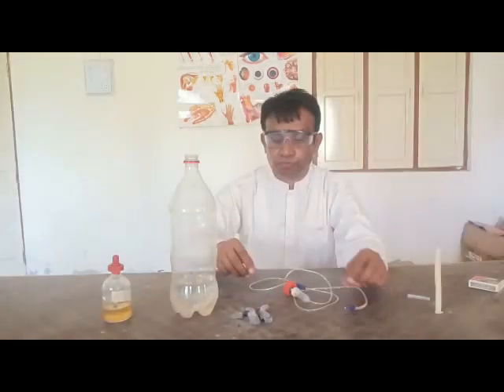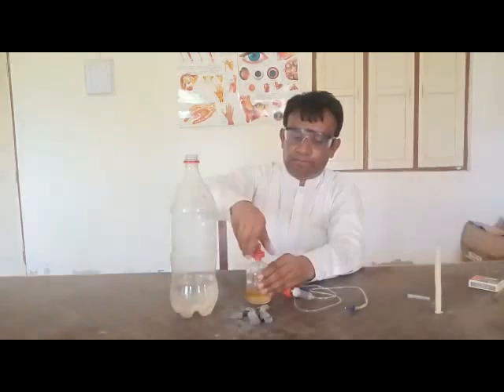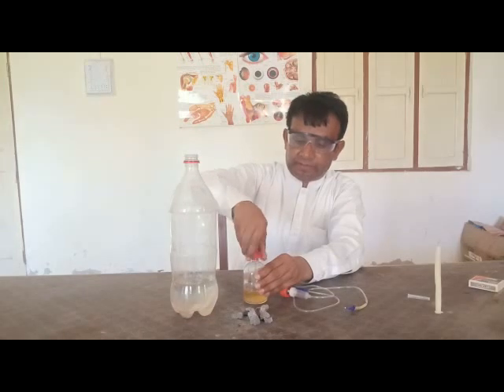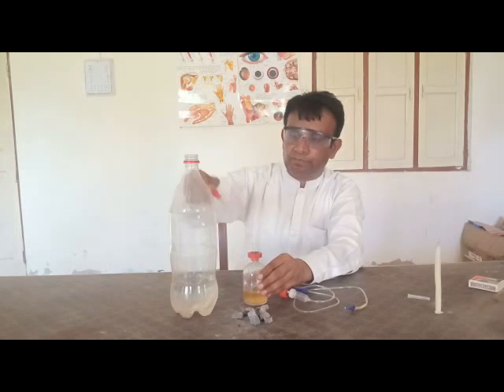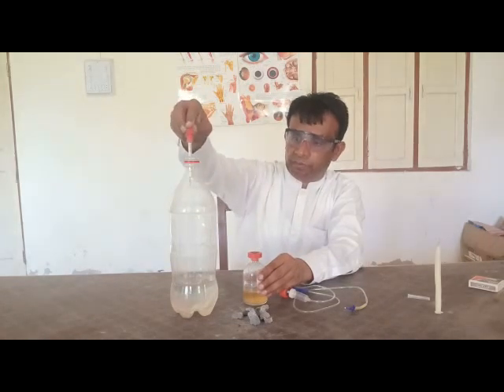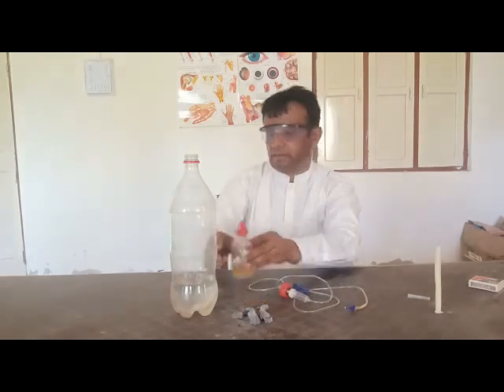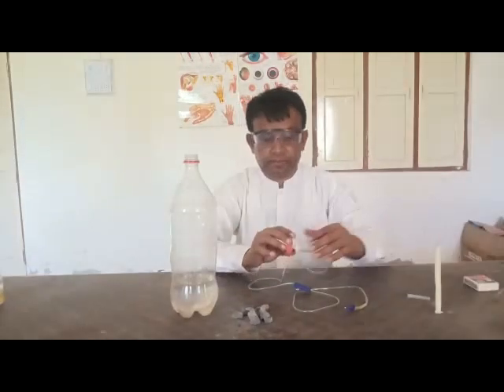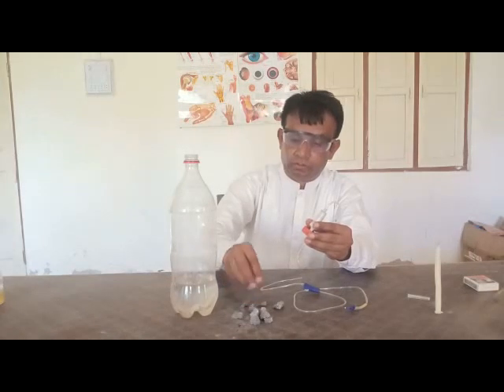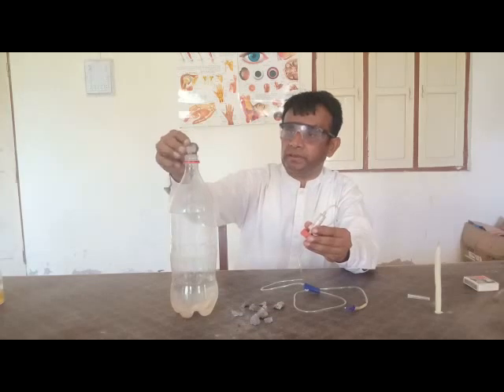What happens? First we will add 2 or 3 drops of the phenolphthalein, so that we can indicate the color of the solution. So if it changes color, then it means that there's a gas. So let's see what happens. We put in a small piece of calcium carbide.